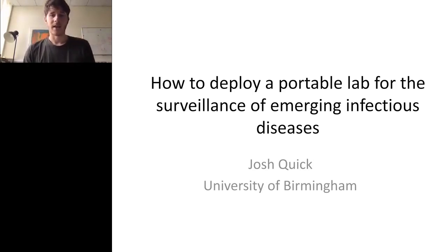And I have traveled to various outbreaks around the world, taking with me a mobile lab with at its heart an Oxford Nanopore portable DNA sequencer. And we have been able to use that technology to tackle and control ongoing outbreaks.